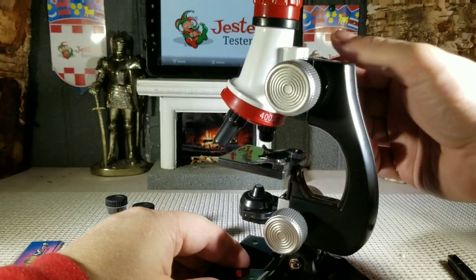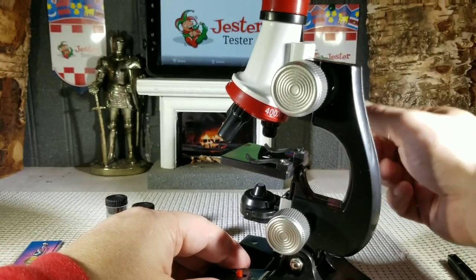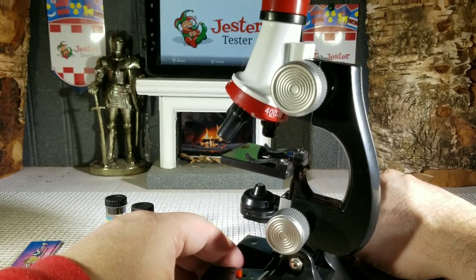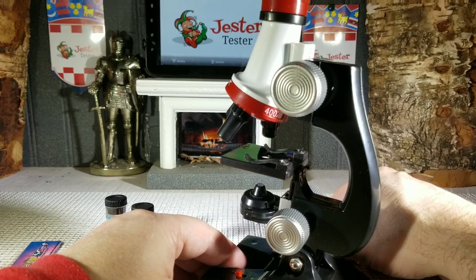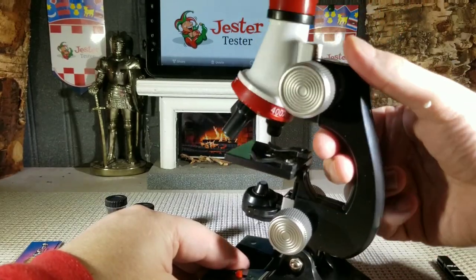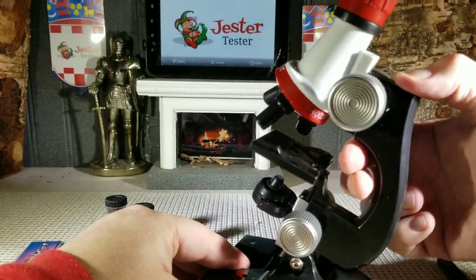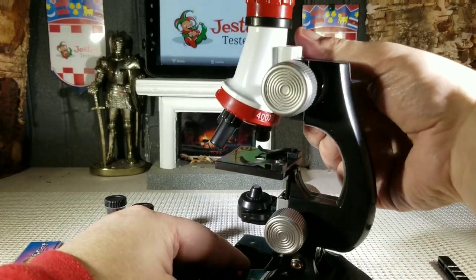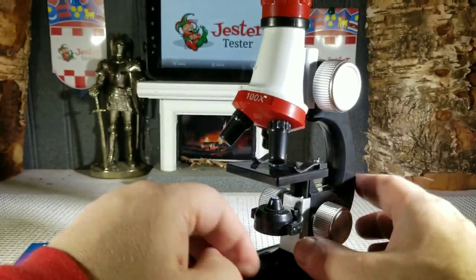You do have to be careful with it — it is made out of plastic, toy grade, as we said. Your child has to handle it a little carefully. It is delicate in that it has plastic knobs and everything like that. But as far as working, it works beautifully, as you can see from the slides we put up. It definitely magnifies just as good as some of the higher-end microscopes I've seen and used. I like that a lot about it, so for a toy it gets a pretty good grade from me.